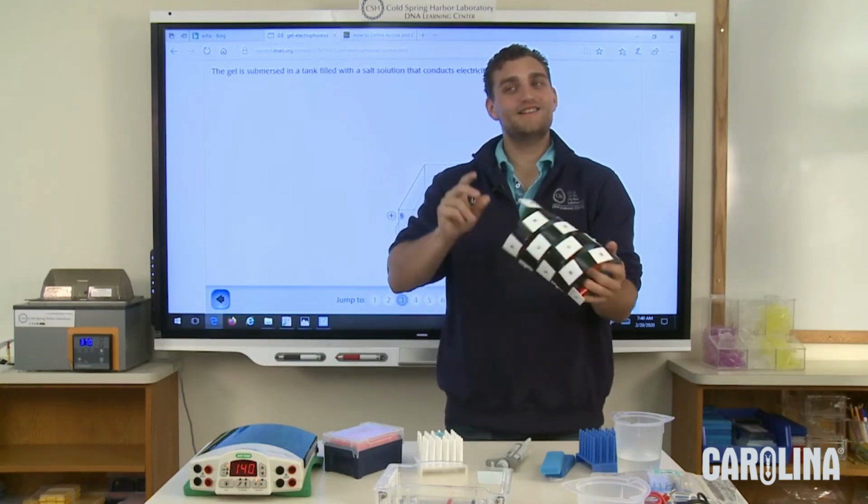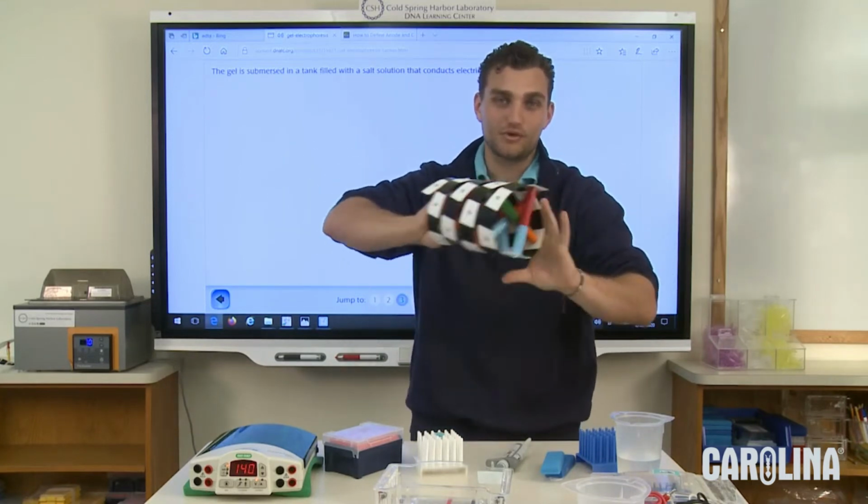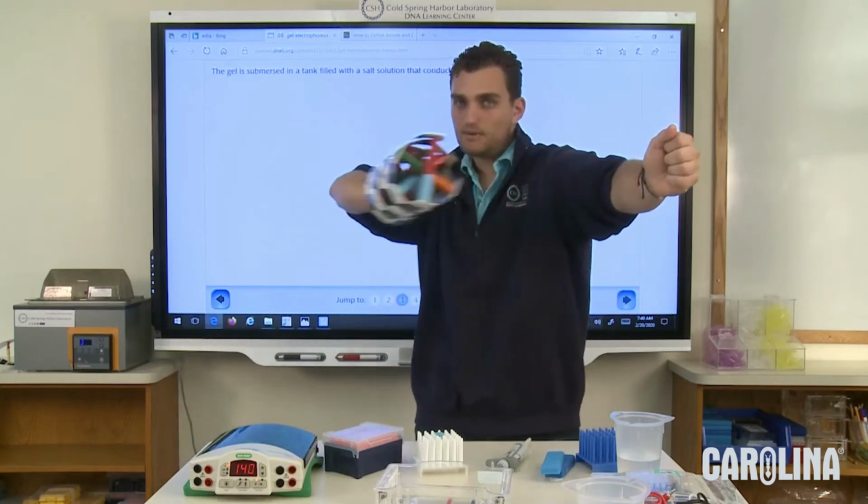Attracted. Not necessarily attracted. So the like charges will... Yes, exactly. They're going to push them away. The like charges will repel, and it's going to cause the DNA to be pushed into the gel.